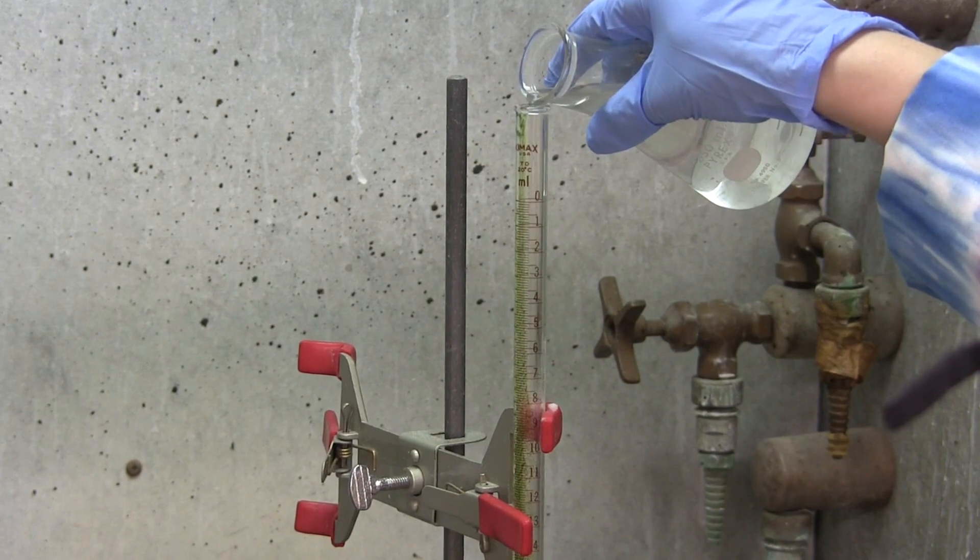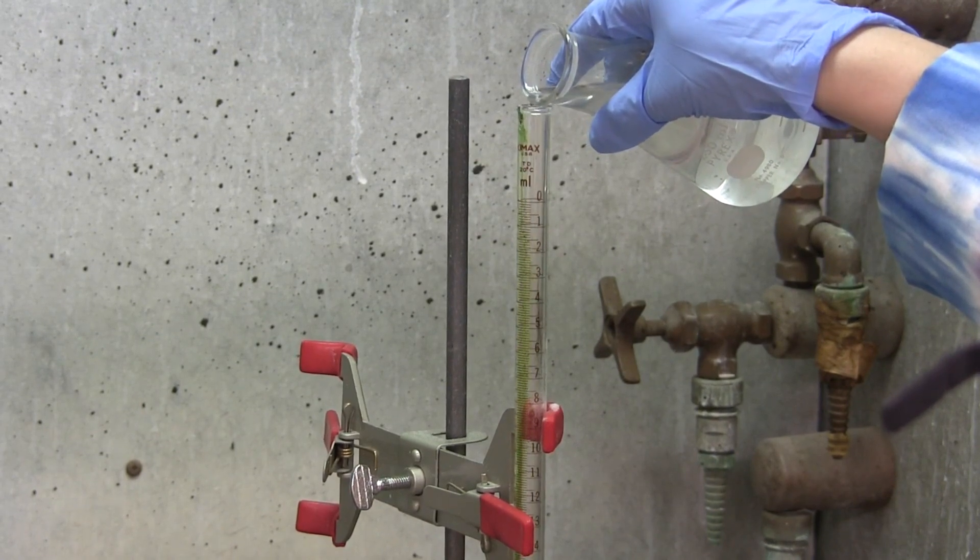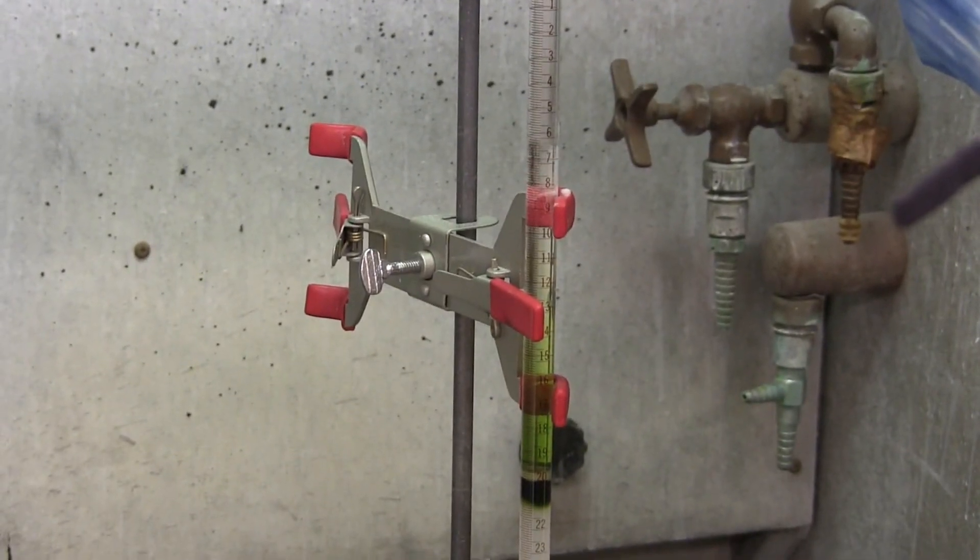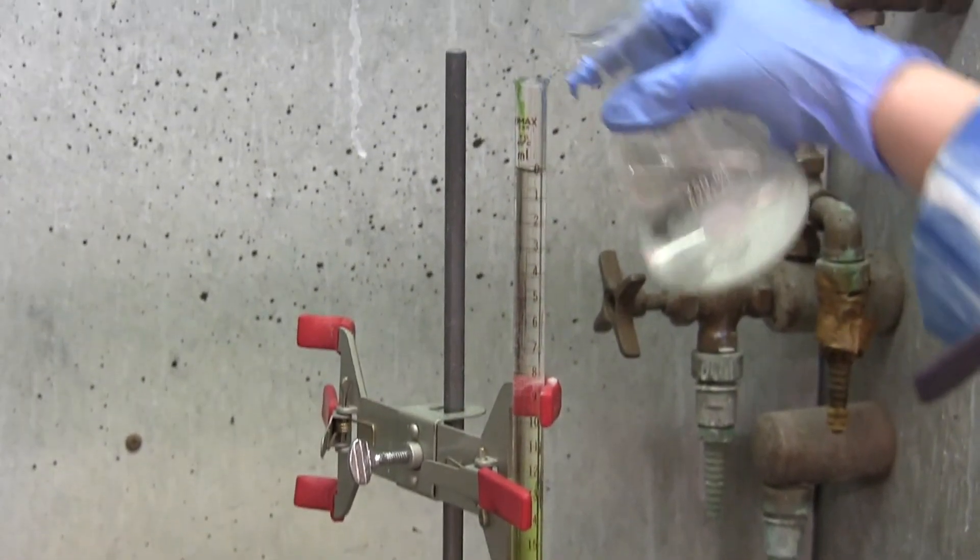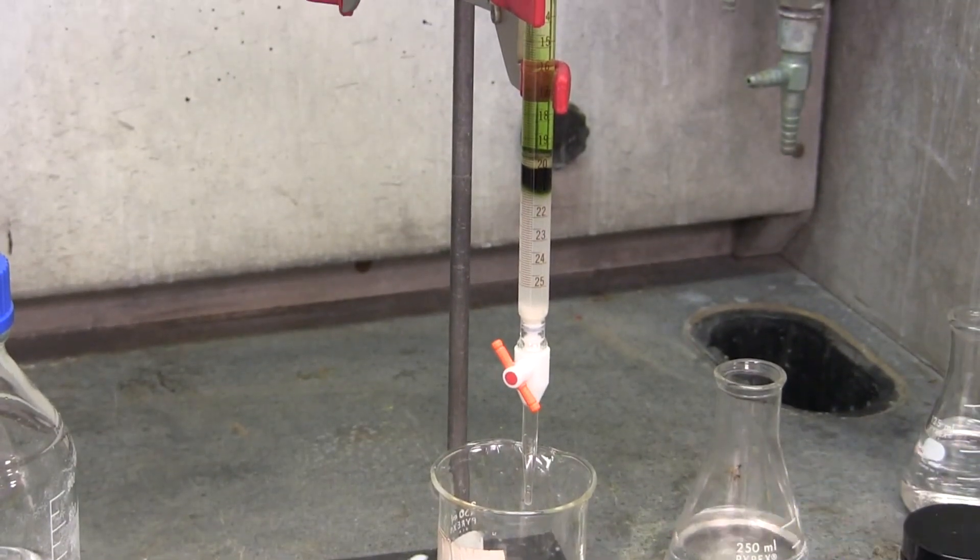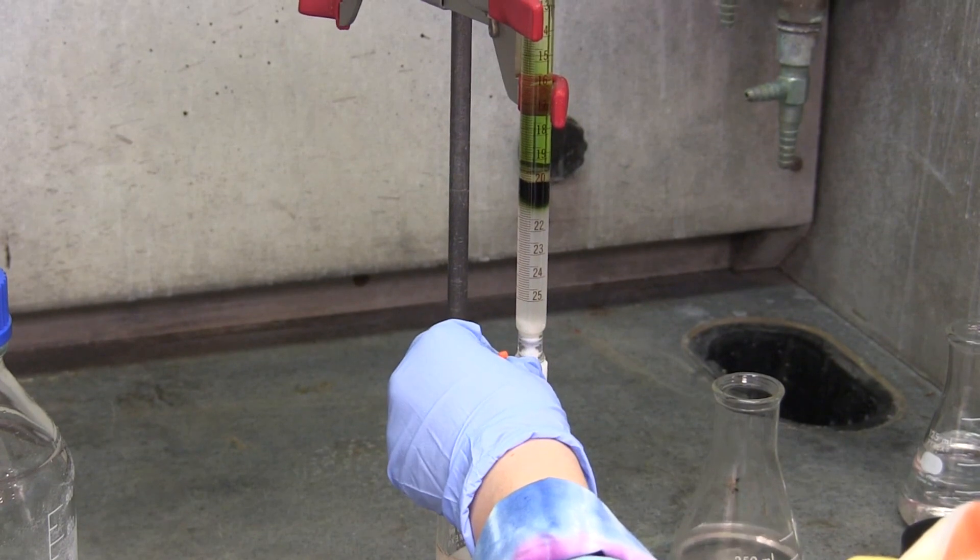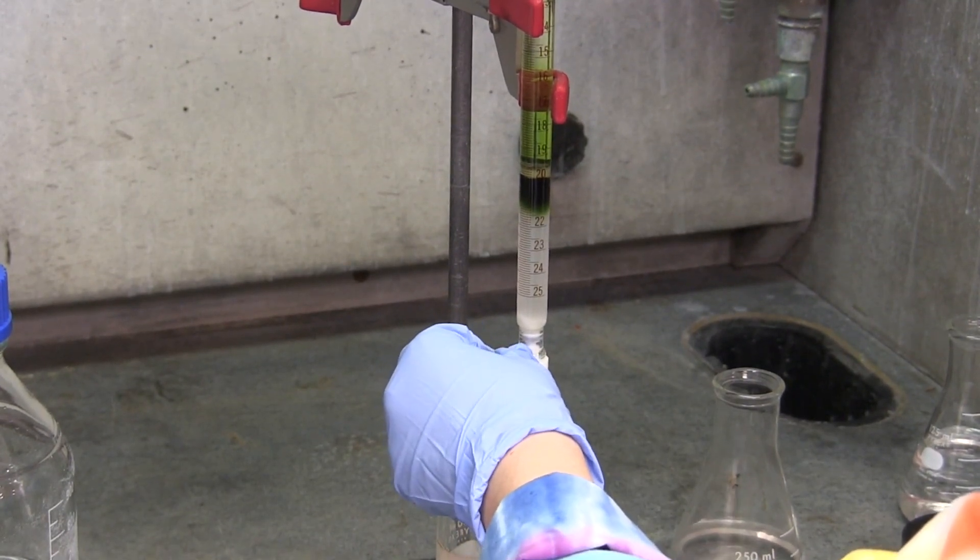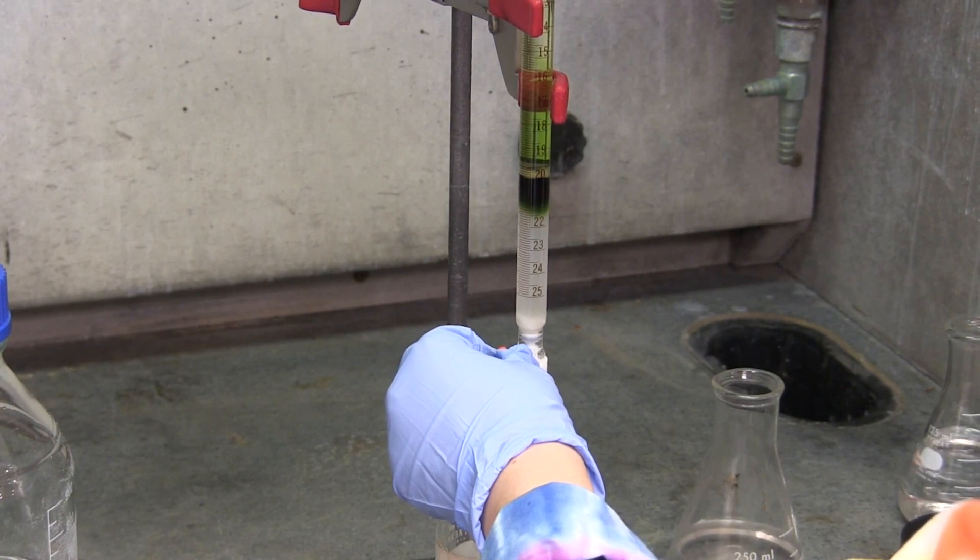The 100% hexane solvent is added to the column, and then the stopcock is opened to allow a steady drip that isn't too fast. This will allow the solvent to start running through the silica column and separate the compounds by their polarities. The silica is the stationary phase of the column and polar, thus more polar compounds will be attracted to it. The solvent is non-polar, which will help elute the more non-polar compounds from the sample.